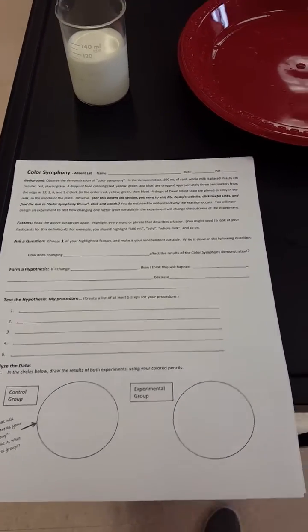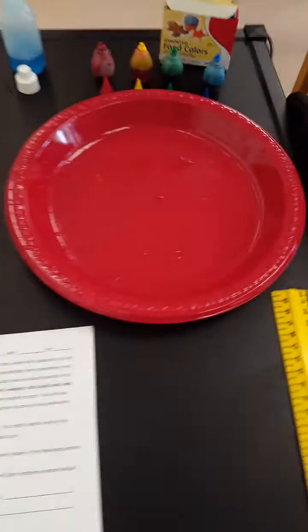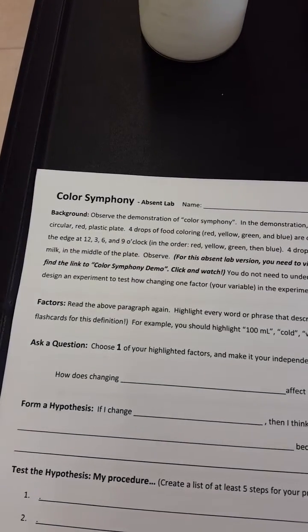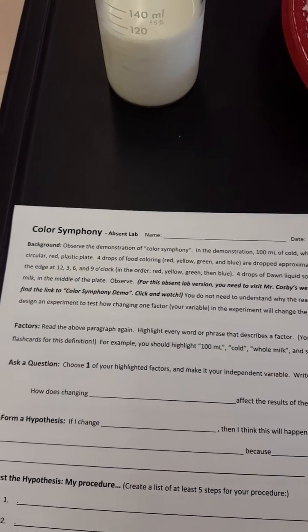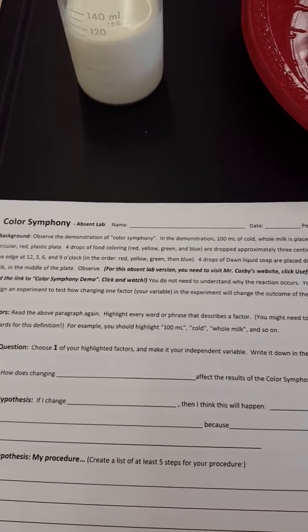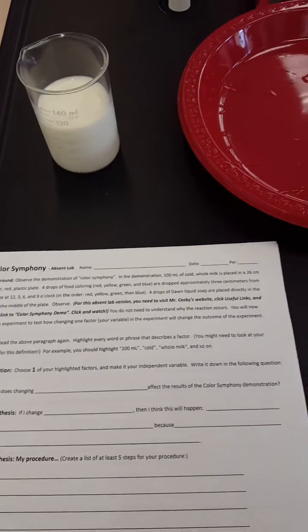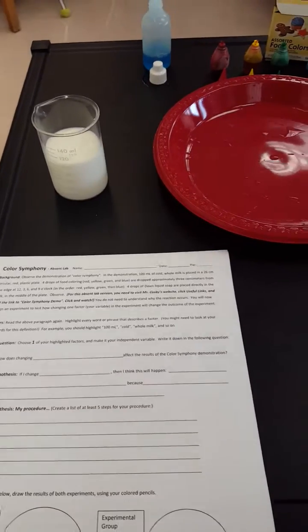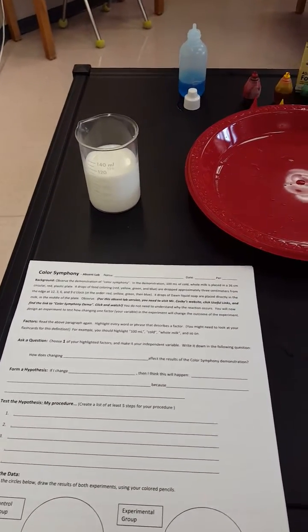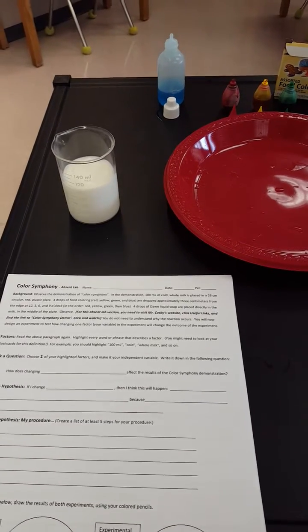So in this lab we're gonna do a little demonstration in this plate, following the background information on the lab sheet. It's very straightforward and tells you exactly how to do it. After I do my demonstration, you're also going to do the experiment but you're gonna have to change something about your experiment, which will be your independent variable.